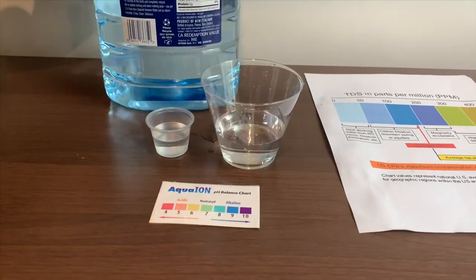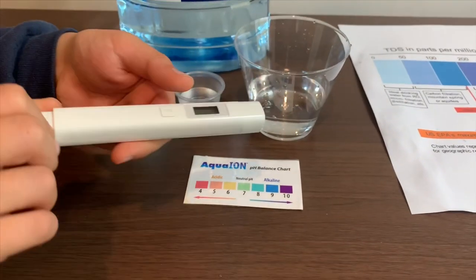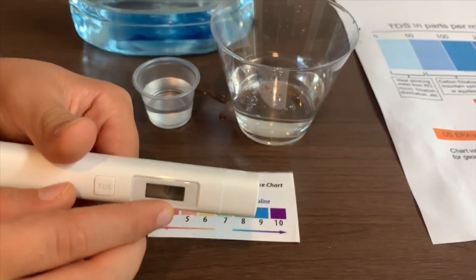First, we're going to test the TDS level. If you want to buy this TDS tester, check the link down below. Turn on the TDS tester, make sure it says zero, and put it in.